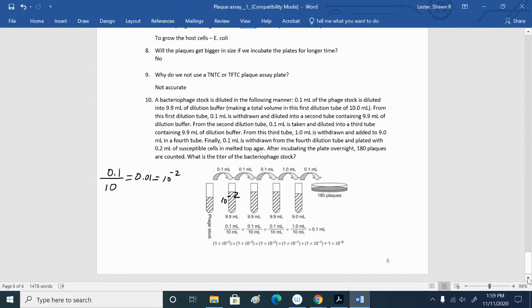So what's the total dilution here? That'll be -4. Yep. And then we do it again. Another 10 to the -2 dilution, but we're diluting a solution that's already 10 to the -4. And so this one becomes -6. Now things change.